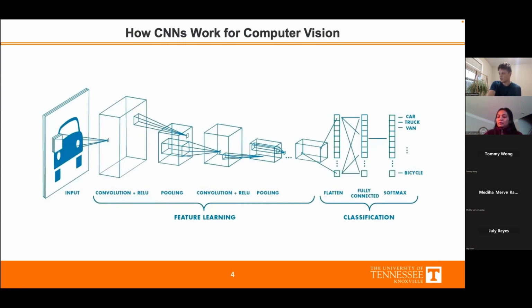And then this is just a schematic that I found online that explains how the architecture would work. This is just a very general interpretation where you have your actual image. It breaks it down into subsets of pixels before passing through convolutions, activation functions, pooling, your fully connected layer, and then getting your statistical outputs, or the probability that it is a specific object and where exactly it may be located.